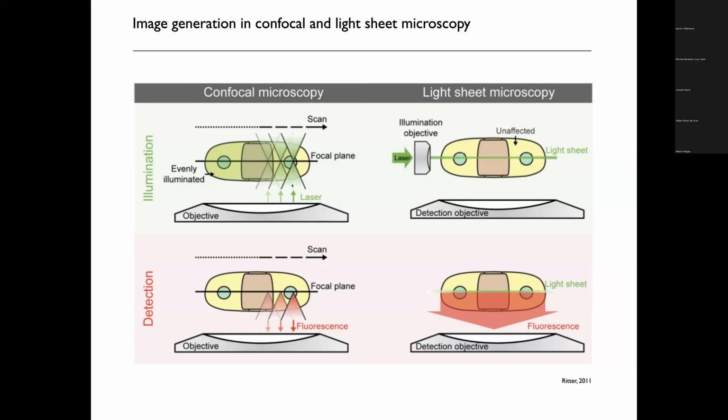We illuminate it in one direction and we scan along one line and then the complete plane. And correspondingly, we detect the fluorescence emission at the respectively excited points using the confocal pinhole. So we have a serial detection and a process which necessarily takes some time.